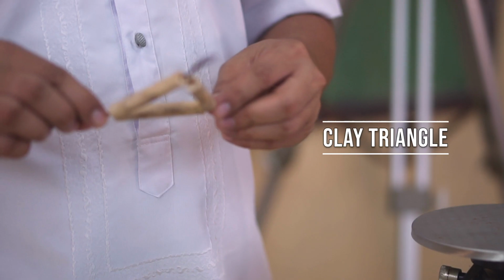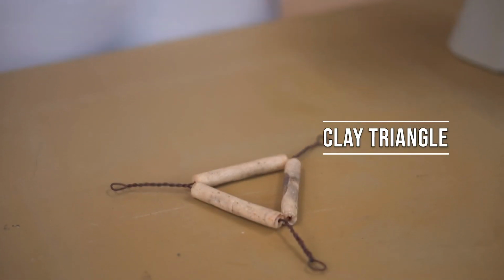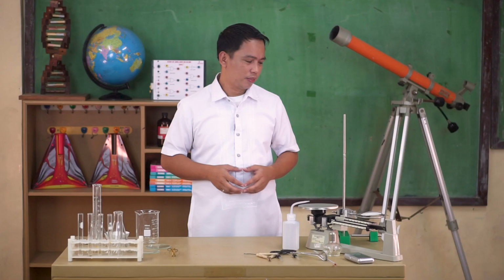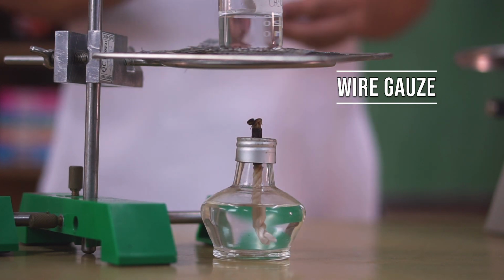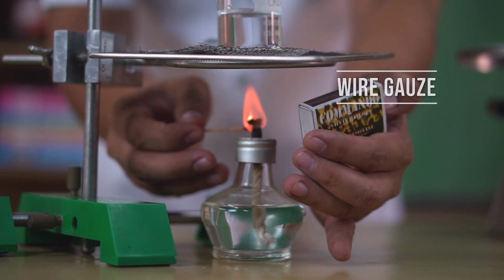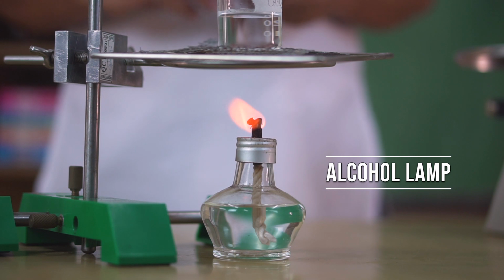Clay triangles are placed on a ring attached to a ring stand as a support for a funnel, crucible, or evaporating dish. Wire gauze supports beakers to be heated by alcohol lamps. Alcohol lamp is used for heating, sterilization, and combustion.